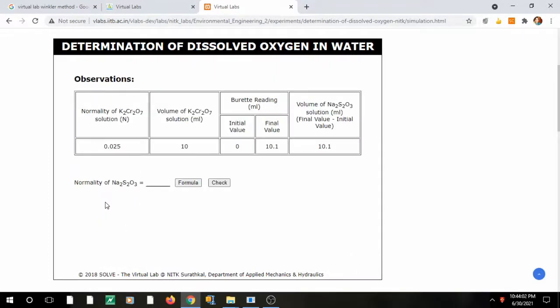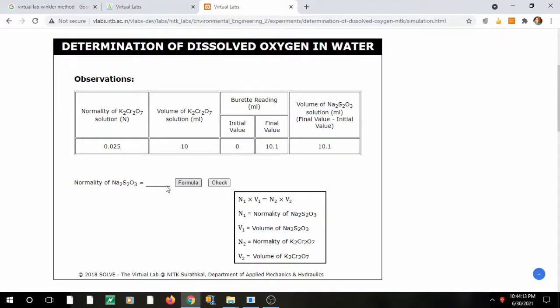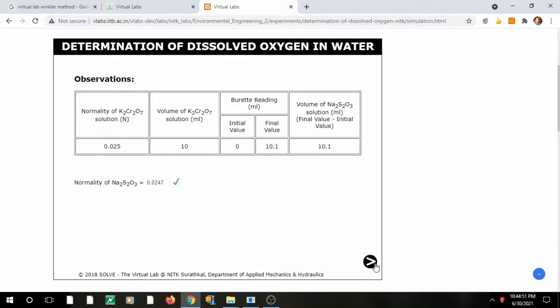The question asks what color the solution turns — the correct answer is colorless. The final burette reading is 10.1. Record this reading and perform the calculations using the formula N₁V₁ = N₂V₂. Calculate: N₁ = 0.025, multiply by 10, divide by 10.1, and you get 0.0247. That is correct. Standardization of sodium thiosulfate is now complete.